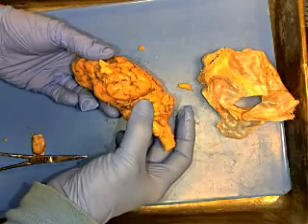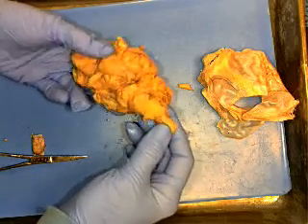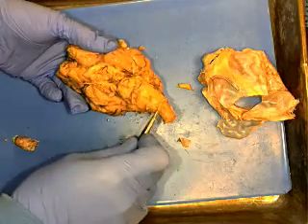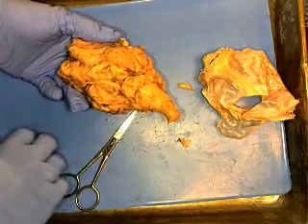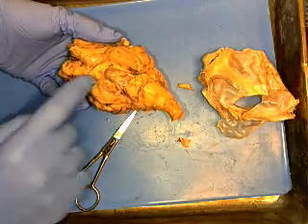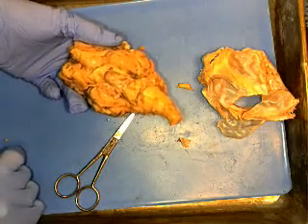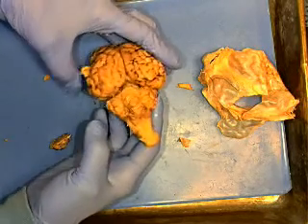The second largest structure, found at the base of the cerebrum, is the cerebellum. And then hooked down here at the very bottom is the spinal cord that is holding my fingers. From here to here is the brainstem, and then we have other structures. This is the pituitary gland that actually fell off, so the pituitary gland is on the ventral surface of the brain. Let me turn it back over to the dorsal surface and show you a couple of structures.